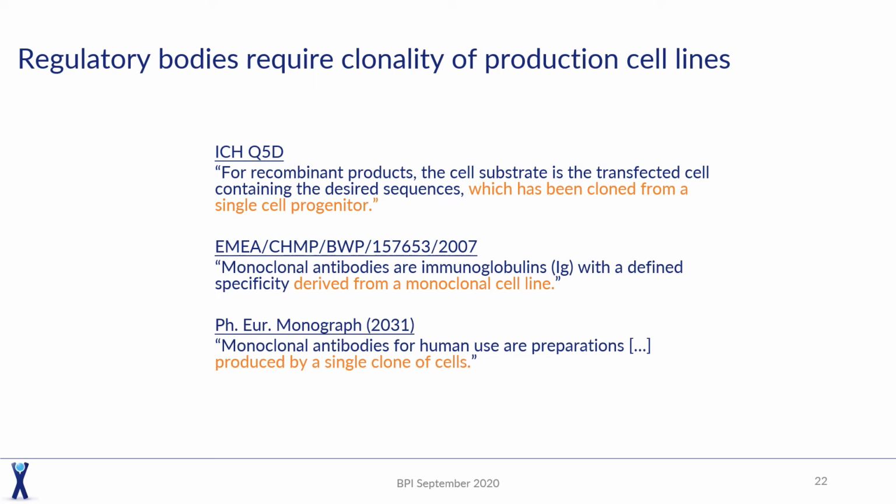Of course, nowadays, if you generate a cell line, one typically obtains high throughput imaging from the FACS sorting. You can have these single cell printers, but especially for legacy cell lines that have perhaps been generated a decade ago or even longer, then if you don't have this supportive data, and you want to submit your cell line, you still have to get some of this data into your filing.